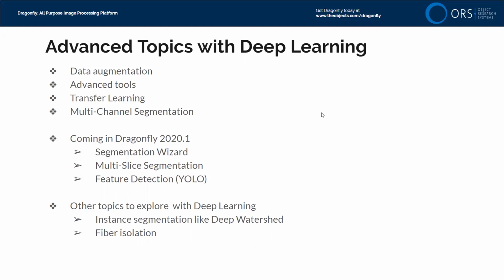Next question is, multi-slice training will be very helpful in 3D fluorescence imaging of cells and tissues. Yeah, so we should actually, someone should implement a confocal deconvolution as a 3D neural network model in Dragonfly. So I'm sure that's been described in the literature, and I submit that it's going to be just as good or better than using the standard methods for deconvolution, where you image a bead or a small point and measure it empirically. Sorry, I got off on the tangent of deconvolution, but yes, it will be helpful.